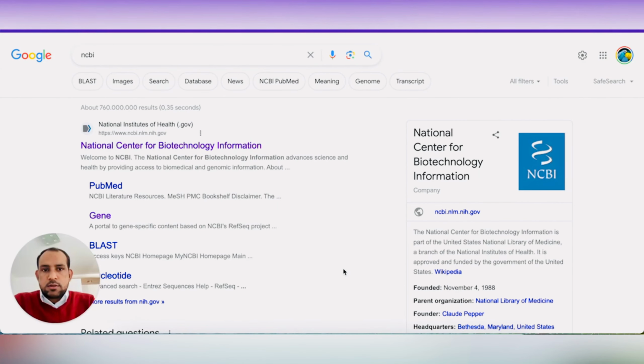So now I will show you how you can download the data, and this data I am going to use for my own data analysis for this video. Welcome back. Now in this part I will show you how you can download data from NCBI and ENA. Both databases are user friendly and I really like both of them, and let's explore one of them.